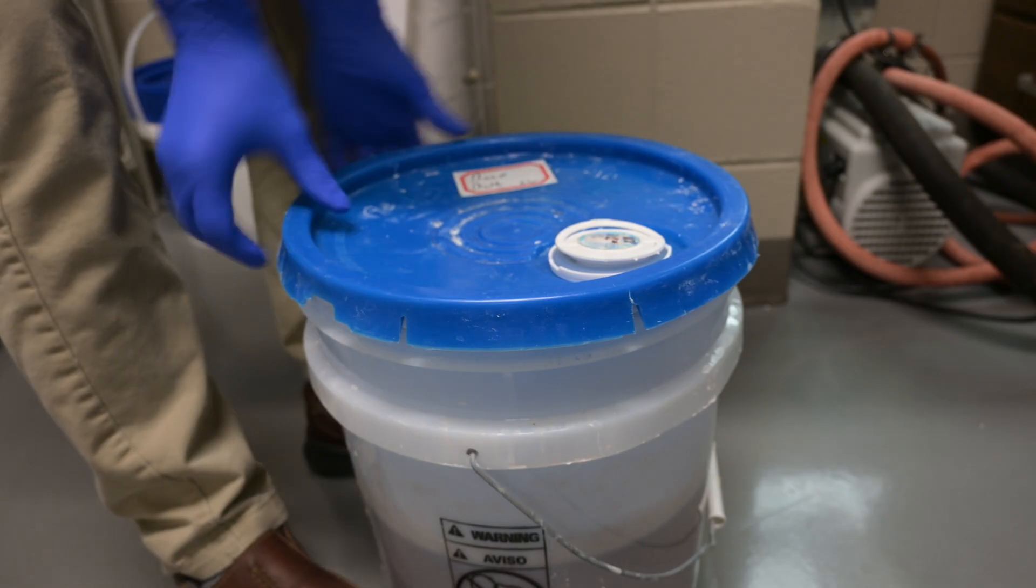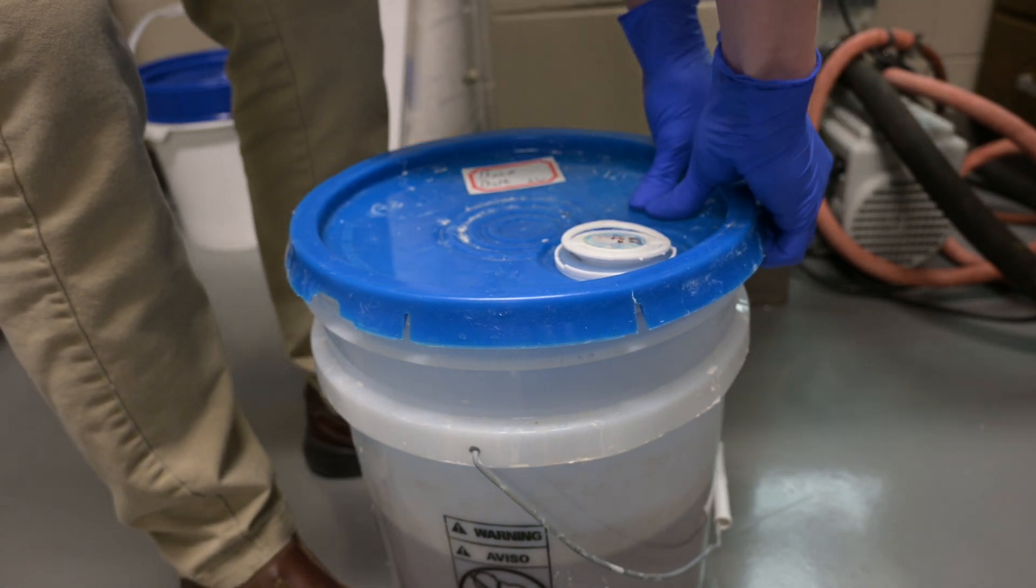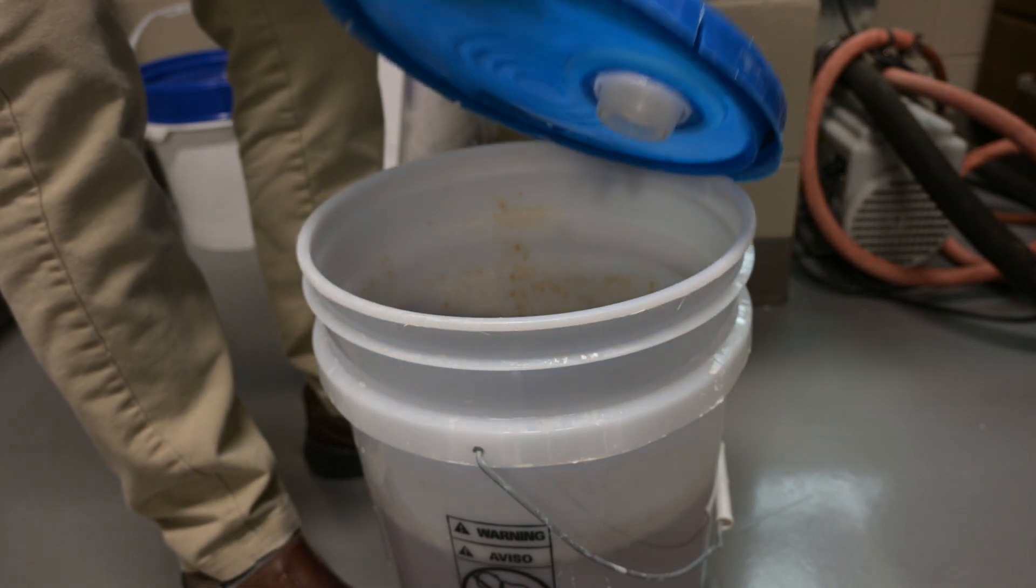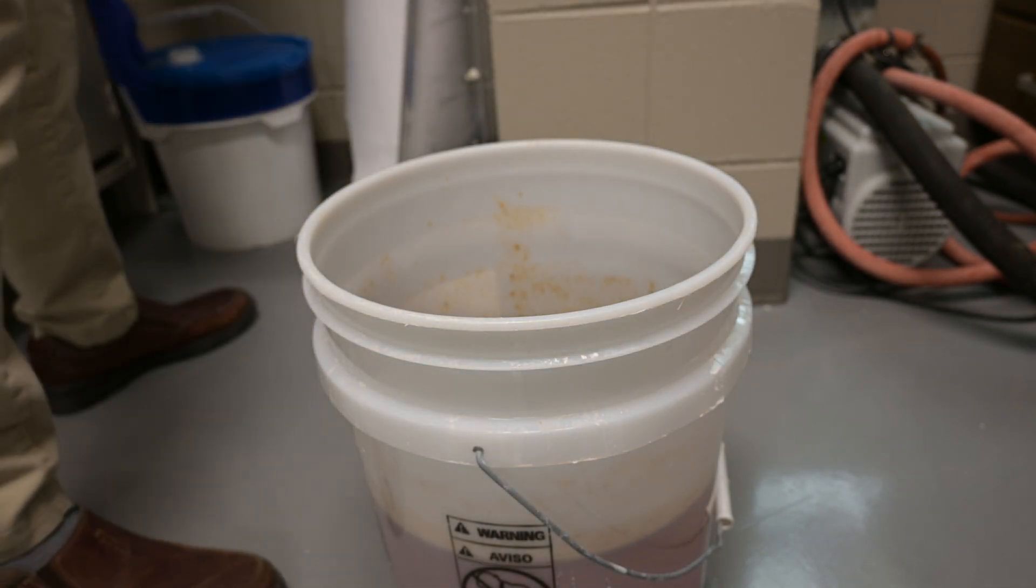For cleanup, I used acetone to rinse out each flask to try to get as much waste out. Next, I placed the glassware into a base bath and soaked them for a few days. Taking them out, we'll have nice clean glassware ready for the next project.